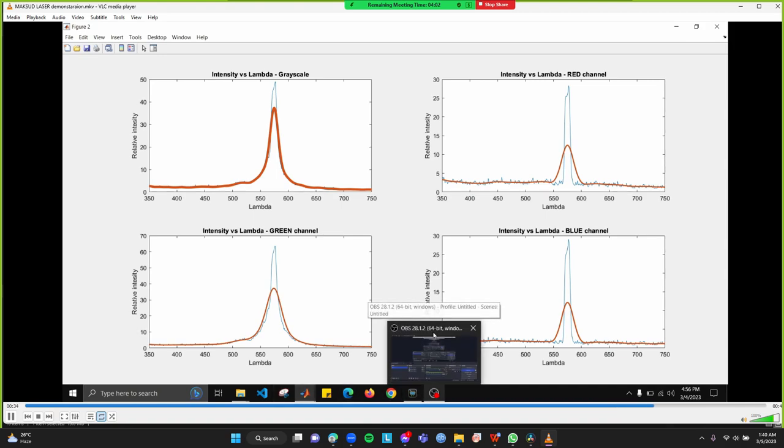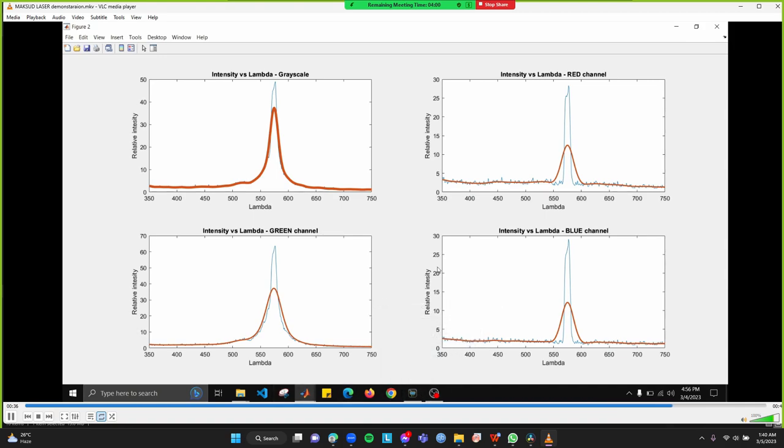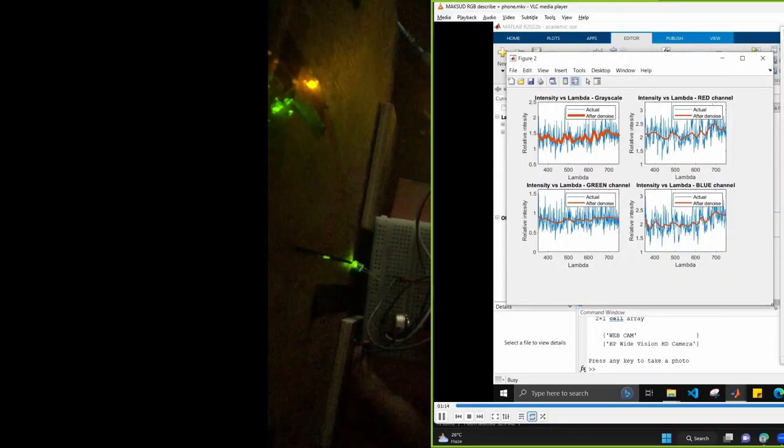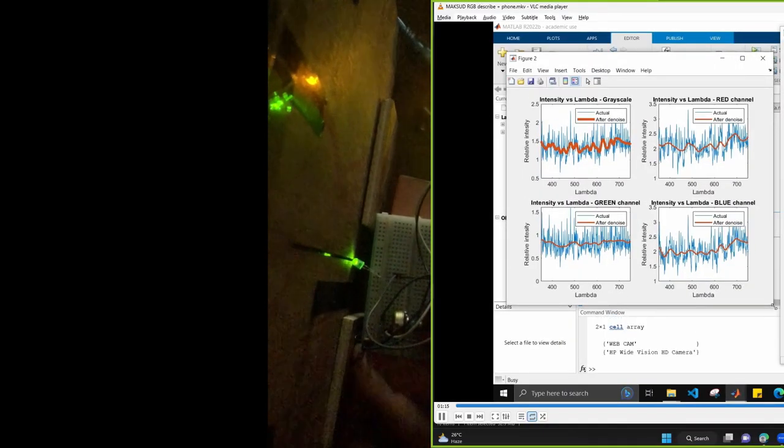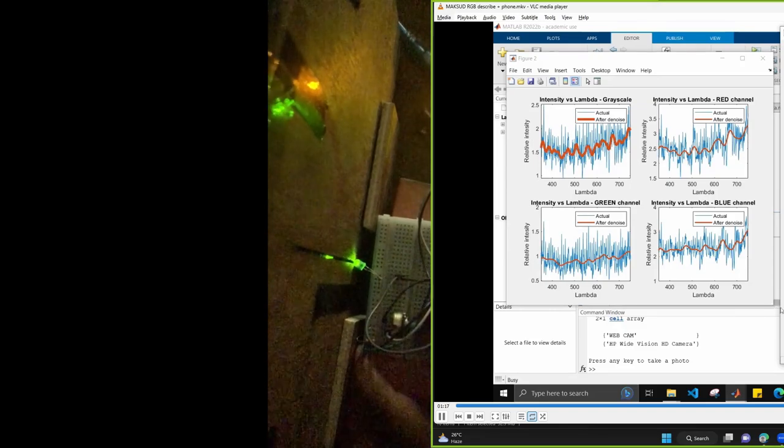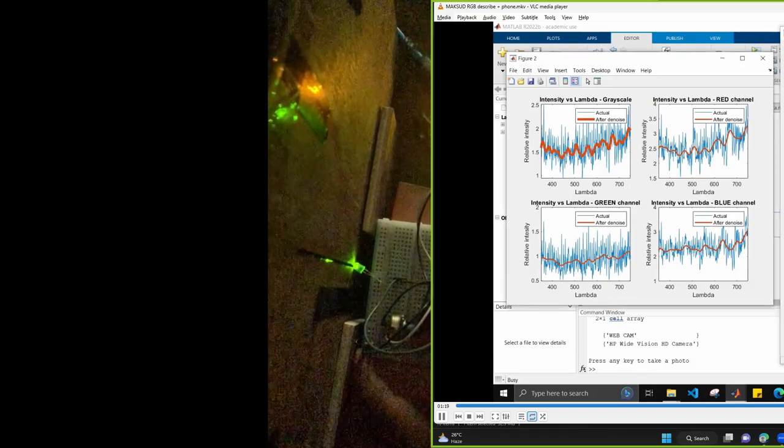And in our software, we can look at each of the portion. At first, for zero intensity, we can find out the noise part will come up. Then we increase the intensity of the light.